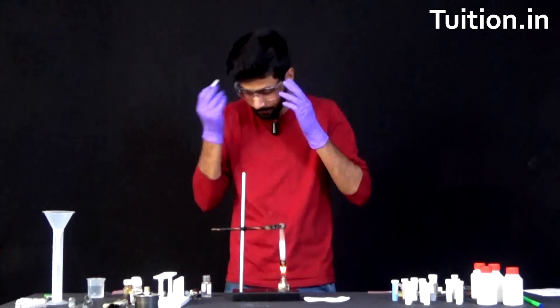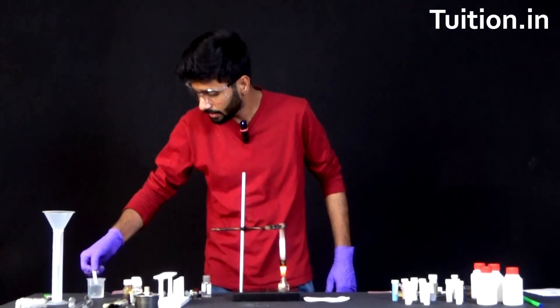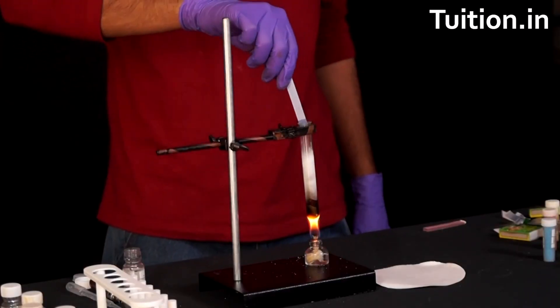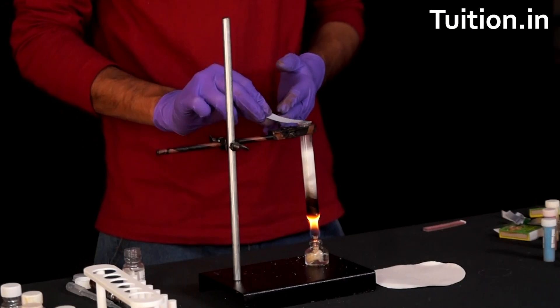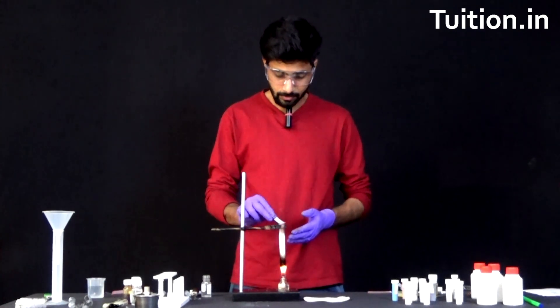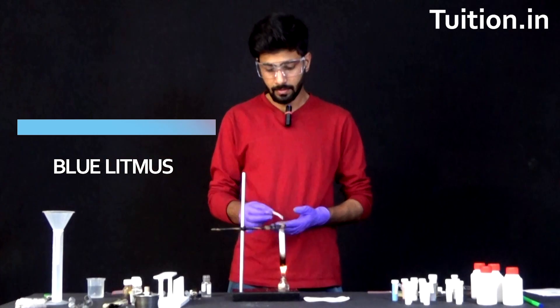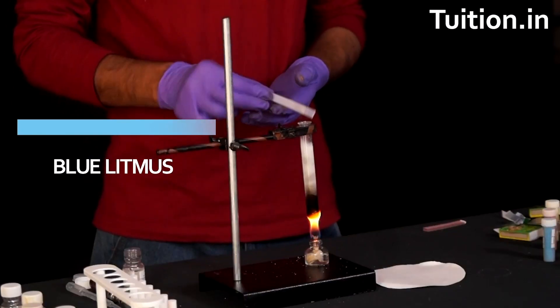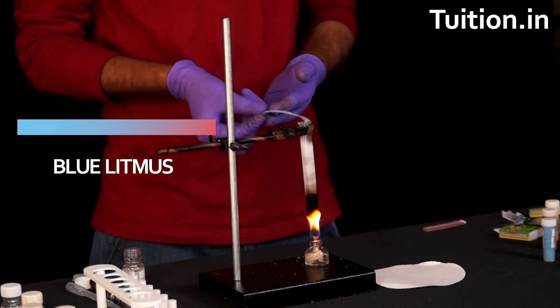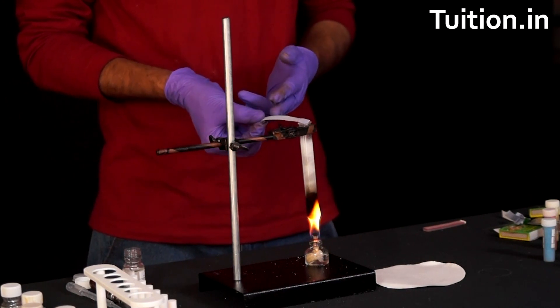Let's also wear some protective gear. Let's take a blue litmus paper and make it slightly moist. Let's bring it close to the mouth of the test tube and keep it there for some time. As you can see, it has slightly started to change color and it's becoming a little red — you can see it at the boundary. It has started to turn red at the boundaries, which means there is a presence of some acidic element in the end products.